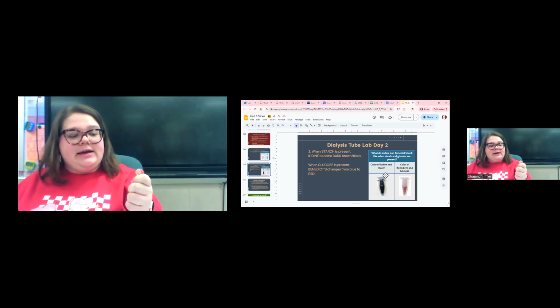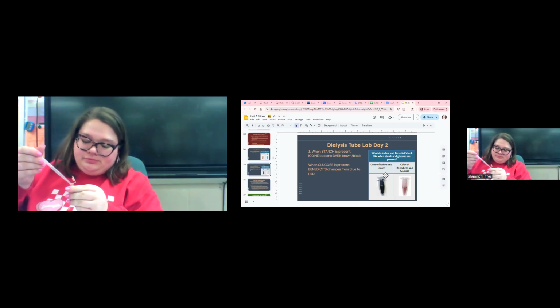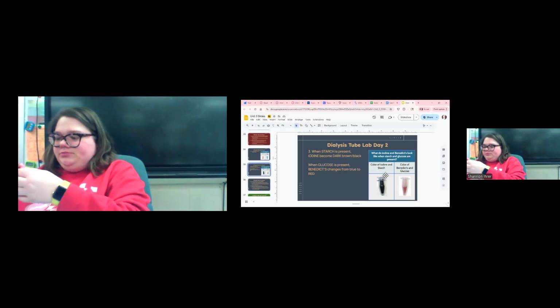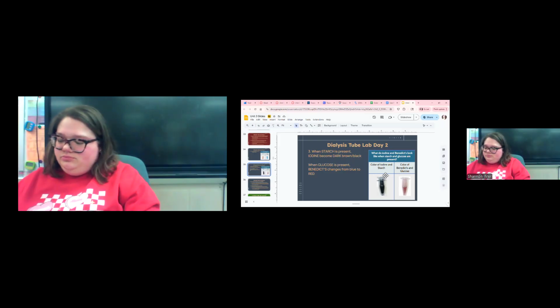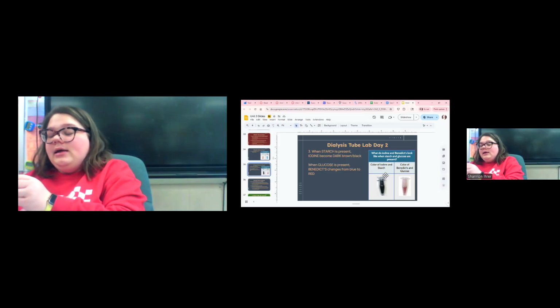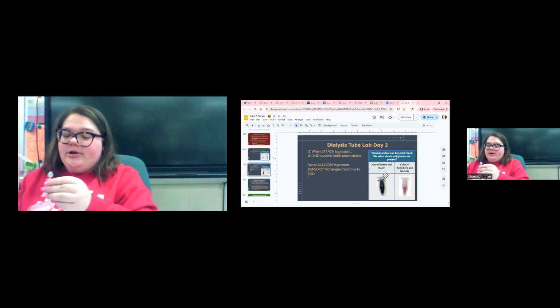Okay, first the container with iodine. And next, the container with Benedict's.